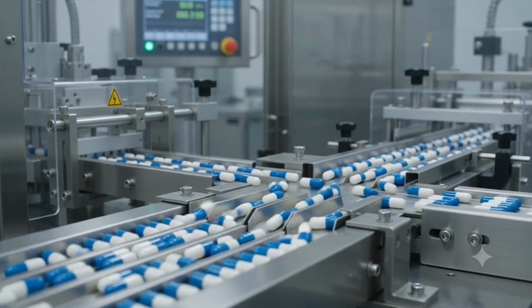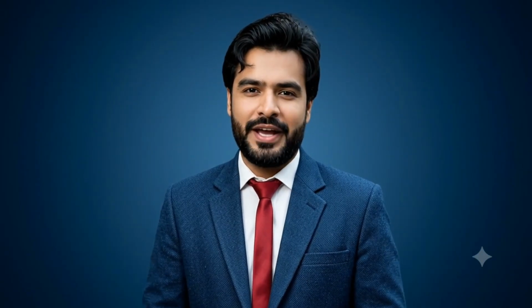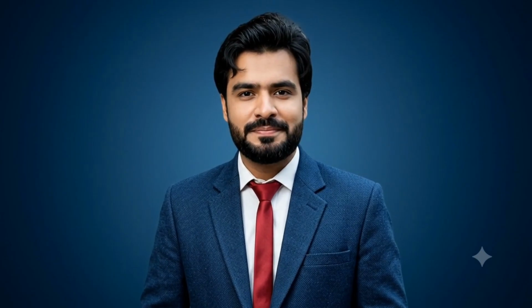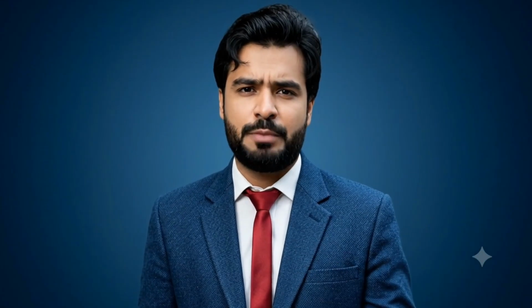Have you ever wondered how pharmaceutical companies make sure every tablet, capsule, or injection is safe before it reaches a patient? We ensure quality every step of the way. A single batch goes through dozens of scientific tests involving highly trained analysts, advanced instruments, and strict international guidelines before it is ever approved. A tiny mistake in the QC laboratory could affect thousands or even millions of patients.